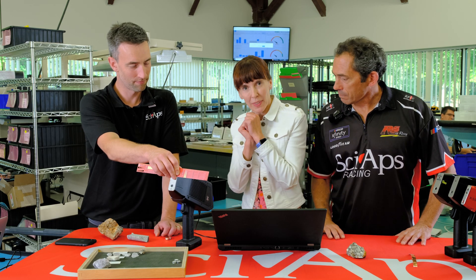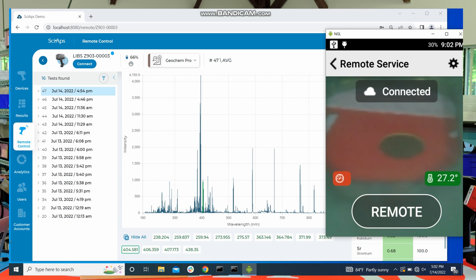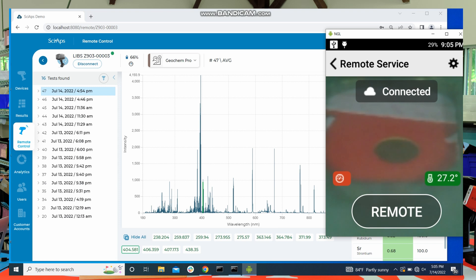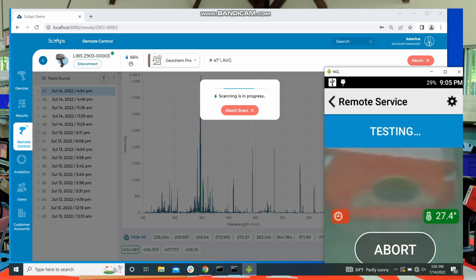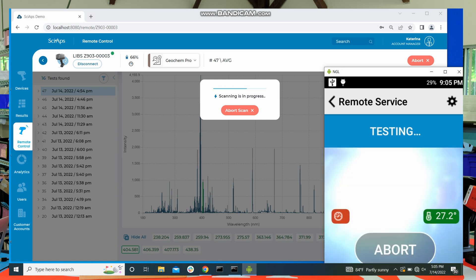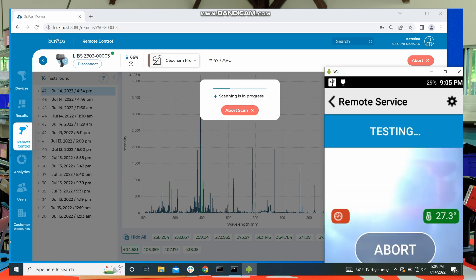Ben is holding a ruler — it's a very important job because, as you can see on the screen, we're trying to hit this gold coating spot, and that's about 300 microns diameter. The LIBS does a 256-test snake pattern in a 16 by 16 raster to look at a spot. Then it looks at each spectrum from each of those 256 shots to assess elemental content as a function of two-dimensional position.